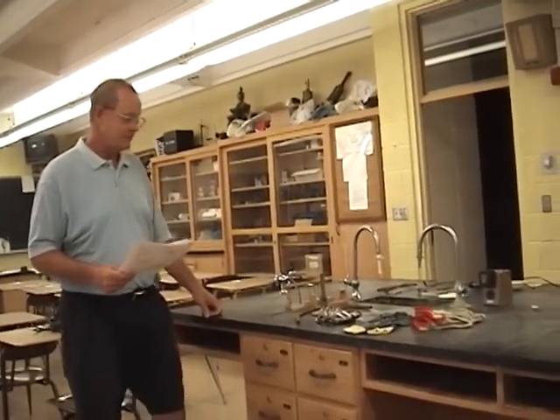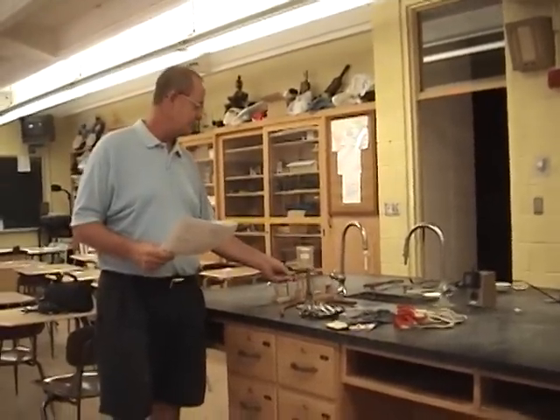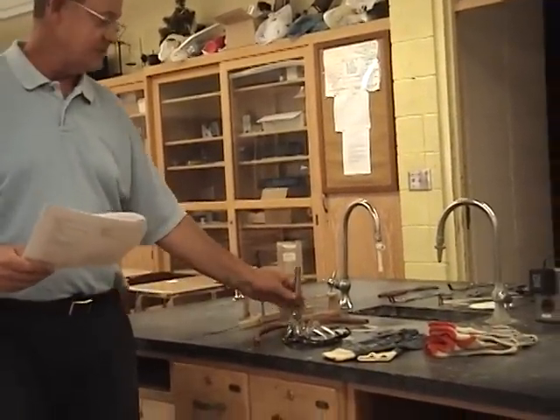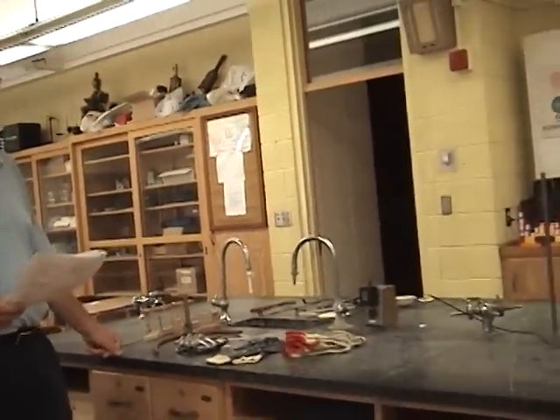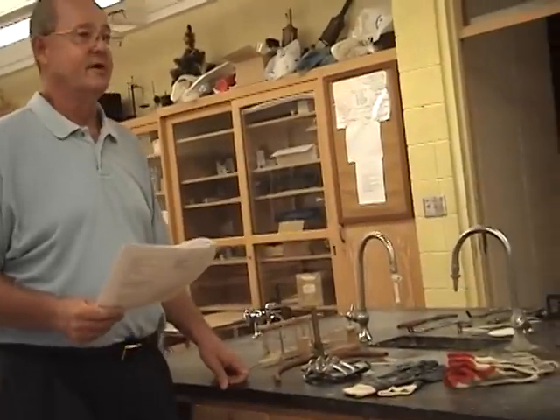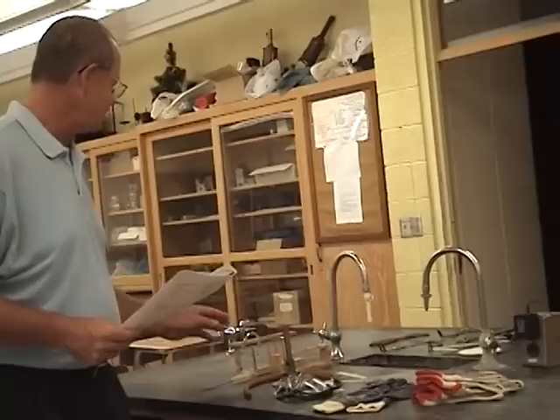We're now looking at what's in Drawer 3. They're pretty much just miscellaneous things you need — a lot of it is safety-related equipment. We have two test tube racks for large test tubes, which also work for medium and mini test tubes, and a small test tube rack. We have a test tube brush to clean those test tubes out. Your Bunsen burner, named for Mr. Bunsen, is here, and over on the north wall there is a poster showing how the Bunsen burner works that I'll show you in a few minutes. We also have a rubber hose to bring natural gas from the natural gas spigots, and a needle valve in the base to control gas flow.